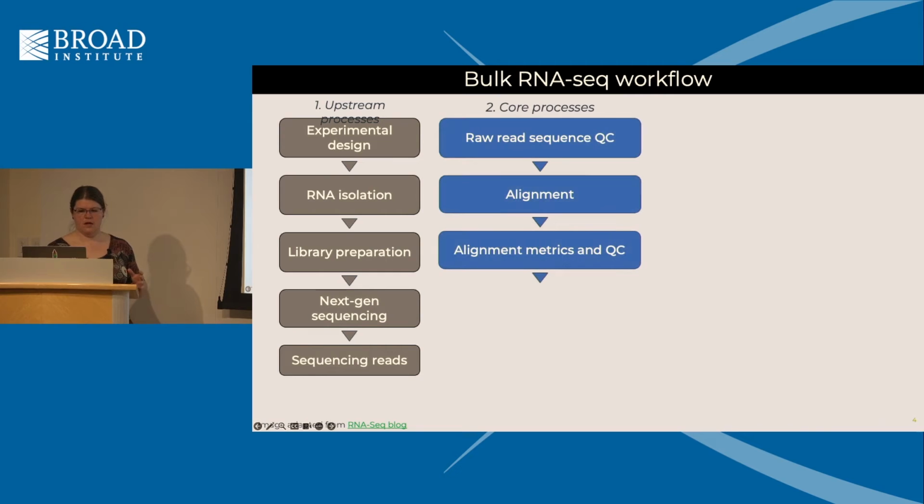So continuing along, the core processes here, to some extent we don't need to do this as much as we once did, but there's raw read and sequence QC. Sometimes the program is called FastQC. Those are available on-prem. I think some of them are fairly easy to deploy in a Docker image environment. Just making sure that something didn't go wrong with the sequencer. There's the Illumina Sequence Analysis Viewer, or SAV. That's something that we can also use on anything that we get back from walk-up, or any other sequencing where you have access to the run folder. And if you want to get real in the weeds about that, just let me know and we can talk about it.